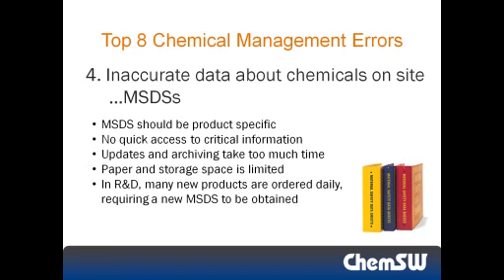I asked the facilities director who was with us, how do people on campus that don't have access to this floor gain access to an MSDS? I guess they don't, he said. So needless to say, this university was definitely out of compliance with OSHA's right to know.